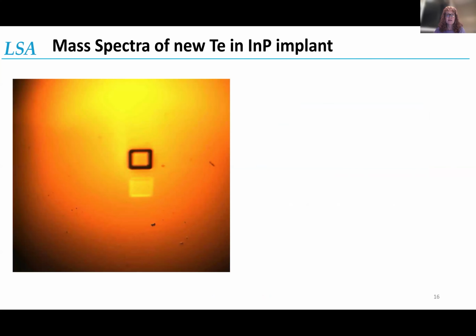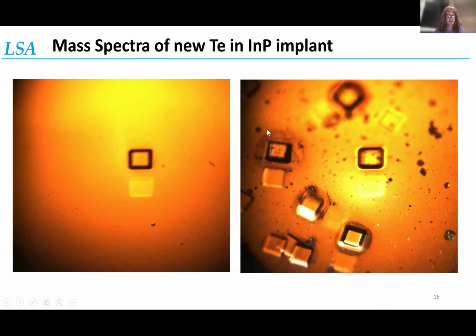So this is what we get with a nice clean semiconductor. We've got some SIMS craters on the sample surface, but as we analyze them and over time, they turn into this. We get lots of pock marks on the surface as the sample degrades after being in and out of the vacuum and being exposed to air, possible moisture. And this can influence the depth profile that we get, and it's not something that we like to do.